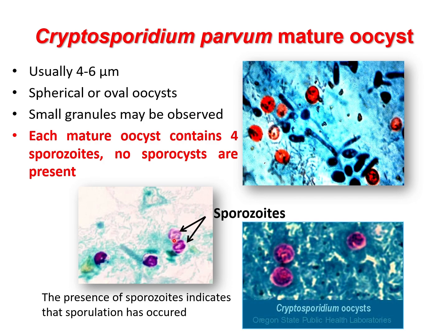What we have is four sporozoites that are naked without a sporocyst. So in the oocyst of Cryptosporidium parvum, we directly see four naked sporozoites without a sporocyst, which disintegrates under the pH of the digestive tract upon formation. And we can stain these oocysts by acid-fast stain methods, and we can count, like here for example, this one is very nice, 1, 2, 3, and 4. So there are 4 sporozoites, and these oocysts can be directly infective.